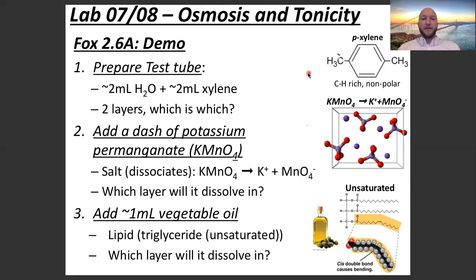What's going to happen? Are they going to mix together well? All right, let's just jump into it. Xylene is nonpolar. Water is polar. Do polar and nonpolar substances mix? No, it's like oil and water. It's like vinegar and oil for a vinaigrette salad dressing. Polar and nonpolar molecules do not mix well. And what we're going to see is two distinct layers.